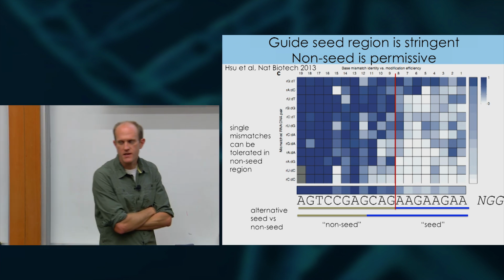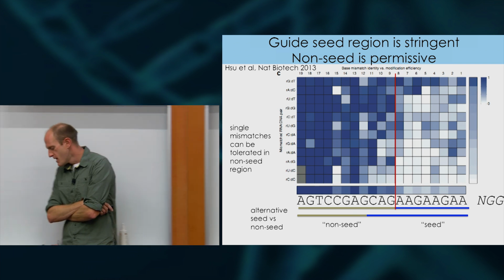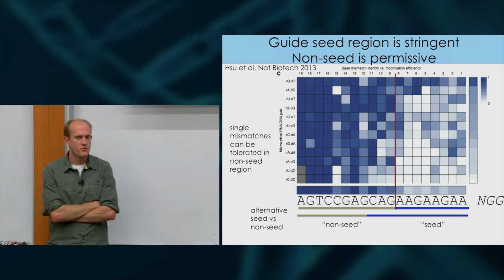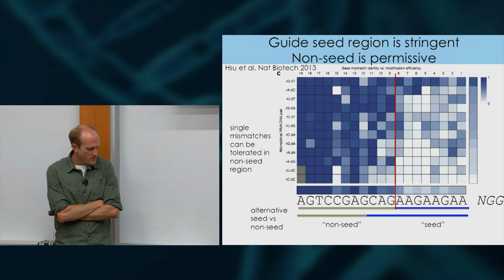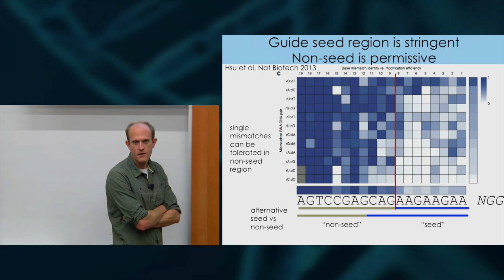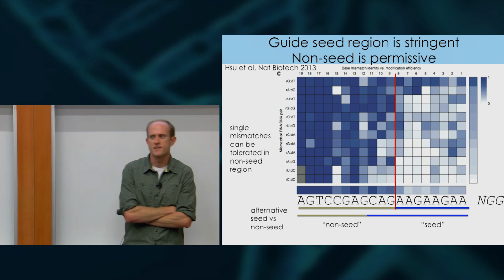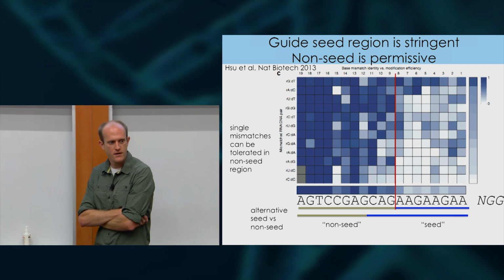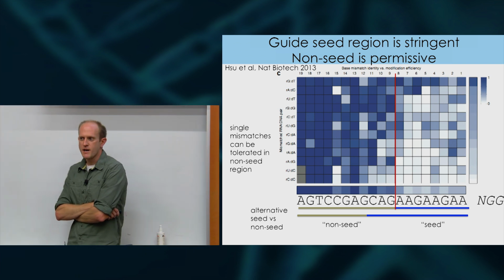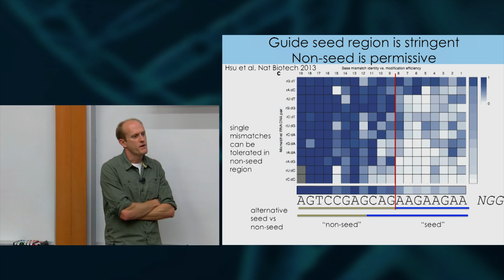One thing that I want to point out about off targets, and I should have said this at the beginning: for most of the people in the room, and probably even for people doing clinical work, off targets in some ways have been overhyped in the literature, and I think dangerously so. People are really obsessed right now with finding all the off targets, predicting all the off targets, doing a huge amount of sequencing to find all the off targets. If you're in research mode and you want to make a knockout, and you came to me and said, I computationally predicted that there are no off targets, I would say that's great, but show me the data anyway, right?